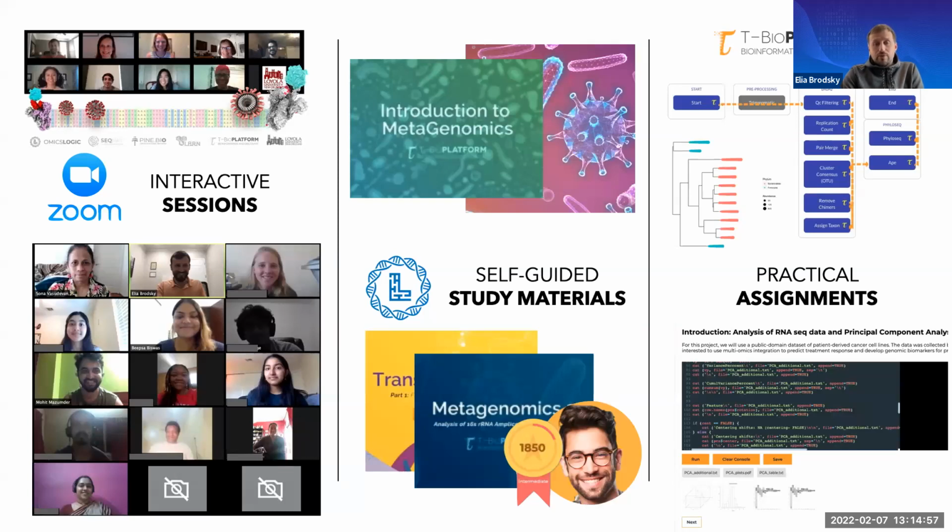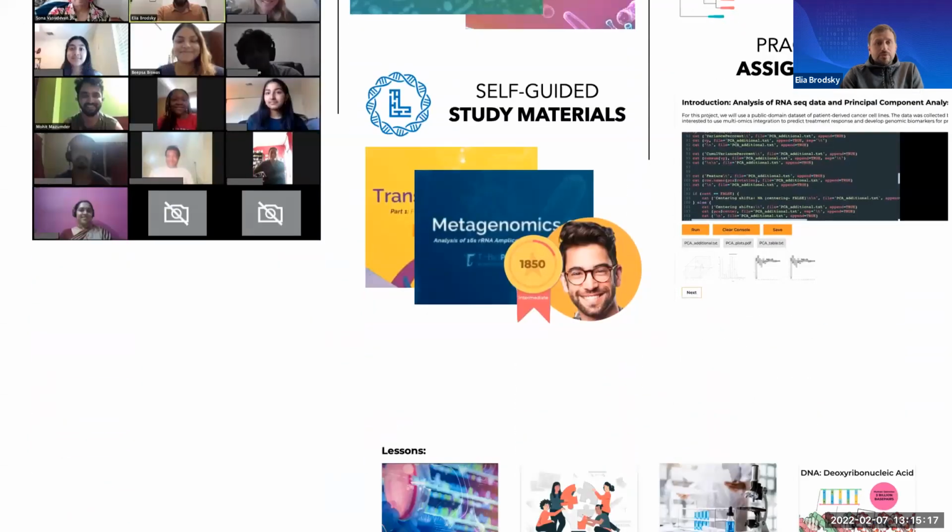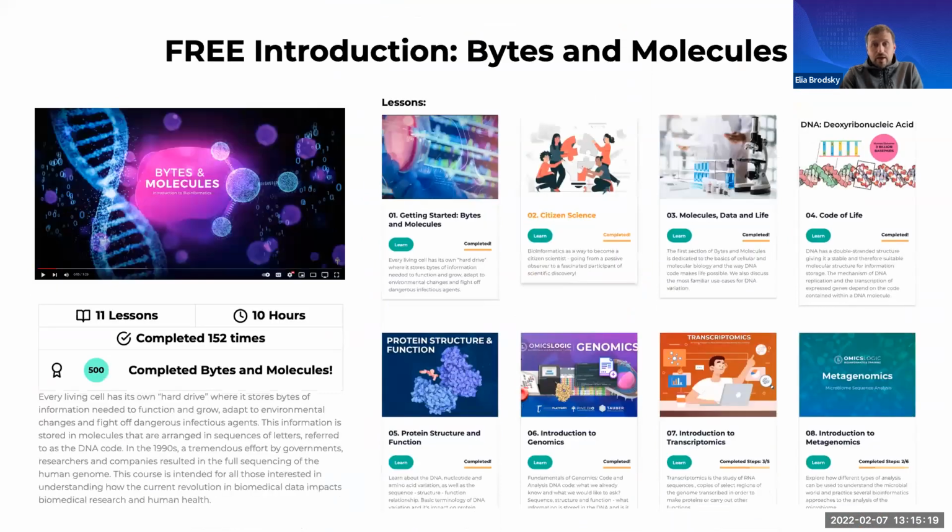And to work with tables, we typically want to visualize maybe the results, maybe filter them. And so all of that will be provided as an example of code that tries to illustrate the main things that you should be thinking about when you're analyzing such data. So again, as I mentioned, some of this material is going to be very basic, and that's intended for those that have no background in metagenomics or bioinformatics for that matter.